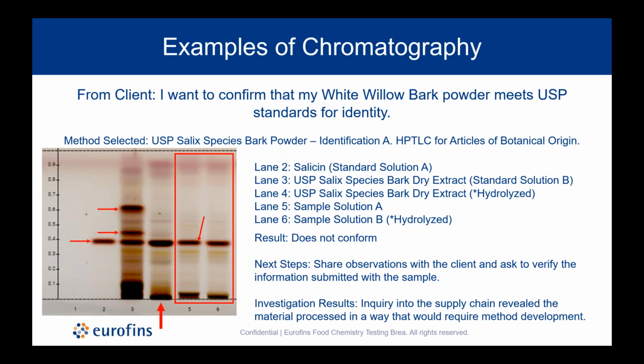So while this sample does not meet the USP standard for identity, which was what the client's goal was, we now understand that potentially method development would be required in order to find a way to trace this material back to white willow bark. While it may not meet the USP standard, it's possible that it could be demonstrated to be derived from white willow bark.